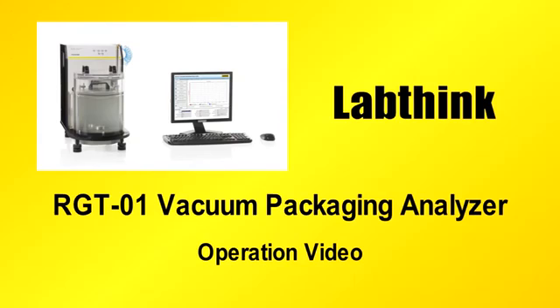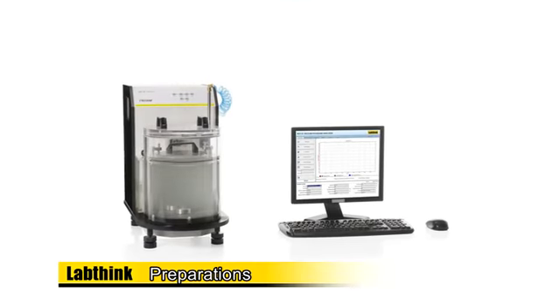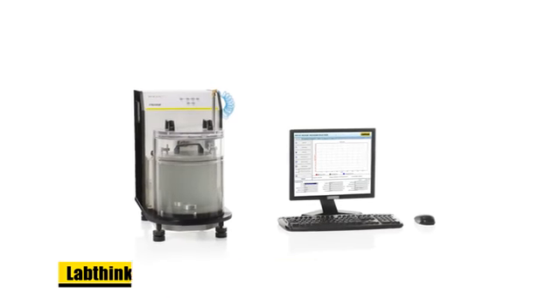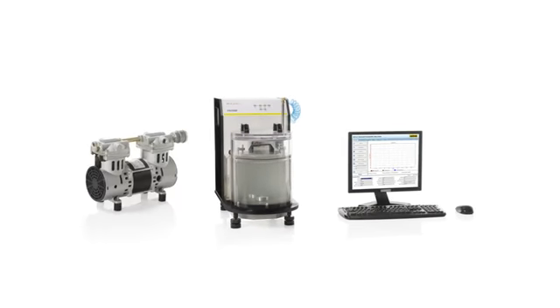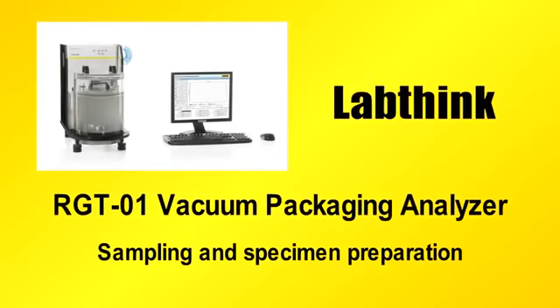RGT-01 Vacuum Packaging Analyzer. Operation video. Preparations: mainframe, monitor, and keyboard. Vacuum pump. Specimen. Sampling and specimen preparation.